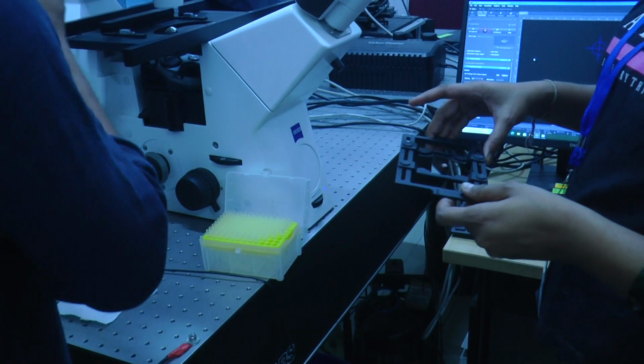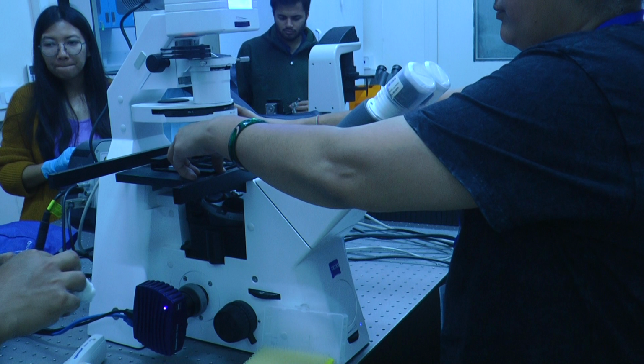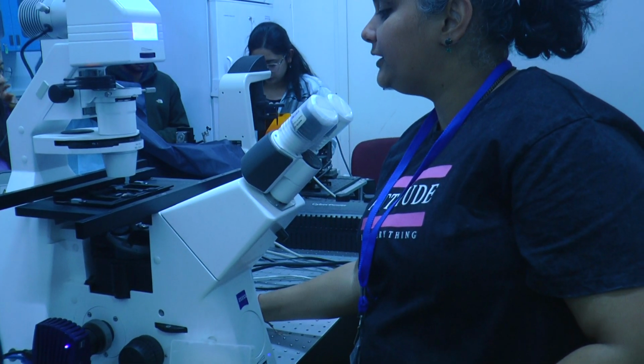Okay. When you are doing the pipetting, do it slowly, because if bubbles are formed, you will not be able to see properly.